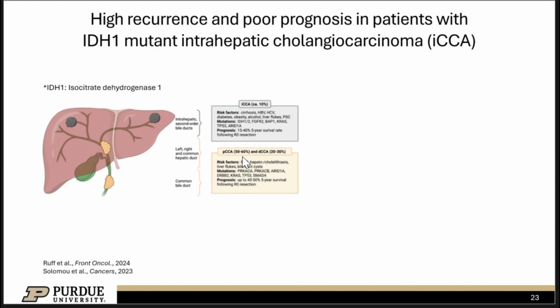Here I want to show an example of using this multiplexing DIA pipeline to study the EV proteins. Here we choose these cancer cell models. This is the intrahepatic cholangiocarcinoma cells, which is iCCA cells. And this iCCA is a bile duct cancer, and it's very aggressive. And currently there are many subtypes identified.